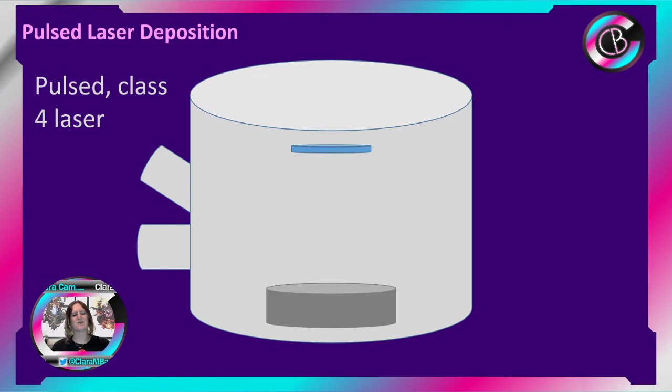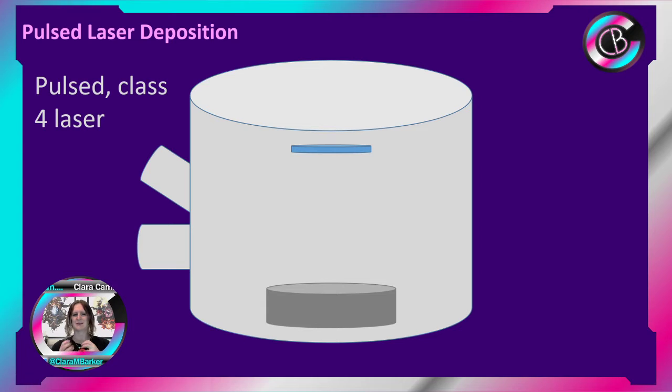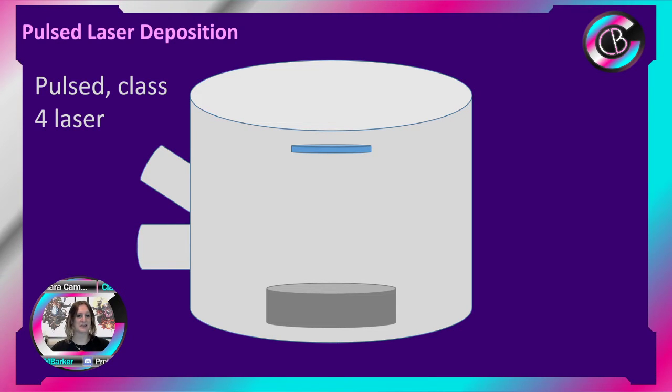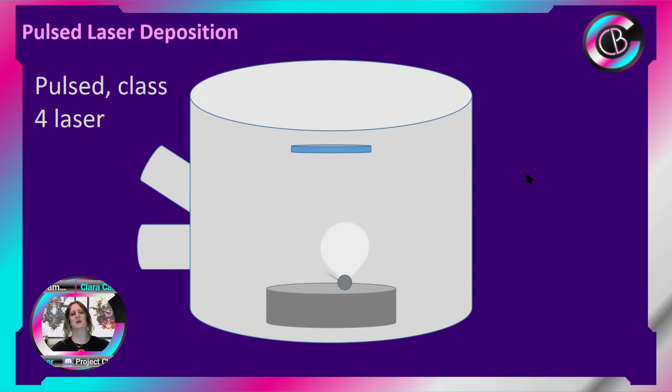It's actually got a wavelength of 248 nanometers, so that's in the ultraviolet range. So if we turn all the lights out, we can actually see this very slight ultraviolet glow as the pulse travels around the fish tank I mentioned before. I'll show you that in a second. But what we do is we take this big laser and we fire it into the system. So hopefully, boom, there we go.